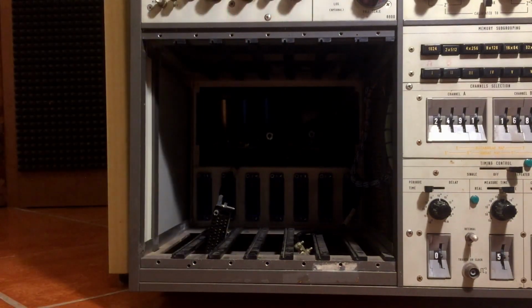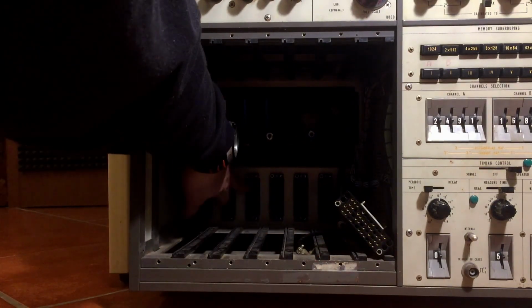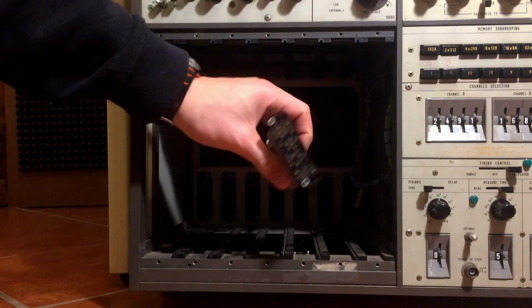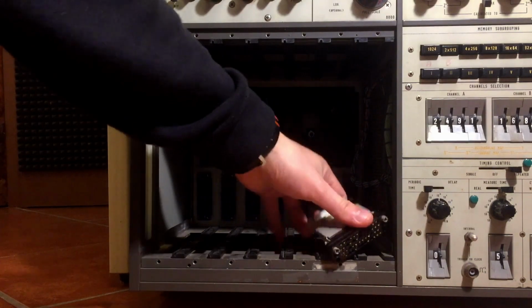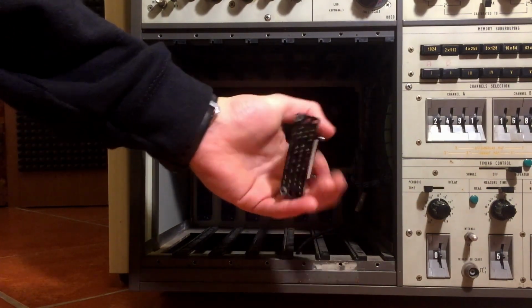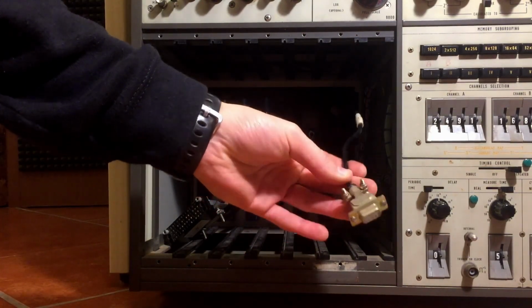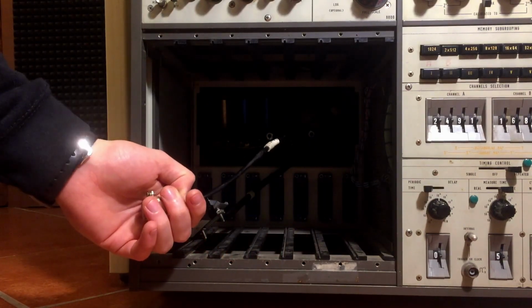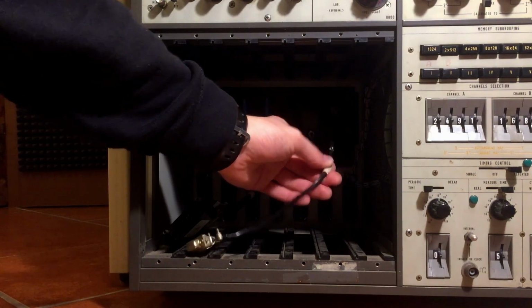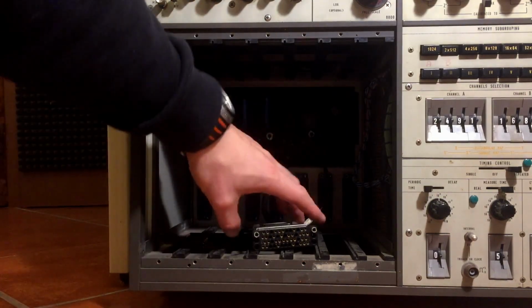Those seem to be standard NIM modules, and by the looks of it, on the bottom here there is the power supply input, and you have your data on this very expensive Amphenol connector. Those are very rare to find, and very expensive. You have a kind of serial interface, RS-232, I don't know. It's nice how they managed to label everything with those little beads. There are no other connections here, so just one single module.